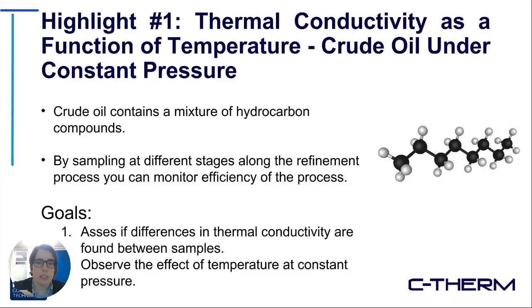So the goal of these kinds of work is to see if the thermal conductivity is different between different sample materials, between different oils, for example, or different extracts, and also to observe the effect of temperature on the thermal conductivity of the oil at a constant pressure. This becomes important looking at the thermal management of, for example, oil pipelines to make sure that you're providing enough heat to them so that they don't start to approach their wax appearance temperature, as one example.